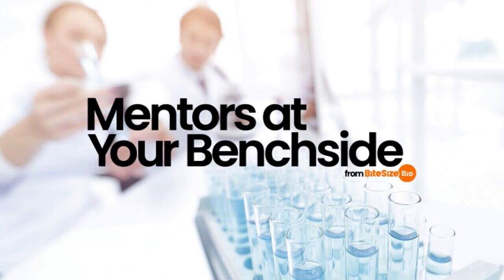1. Photon production. Confocal laser scanning microscopes are based on conventional optical microscopes, but instead of a lamp, a laser beam is focused on the sample. The intensity of the laser light is adjusted by neutral density filters and brought to a set of scanning mirrors that can move very precisely and quickly. One mirror tilts the beam in the X direction, the other in the Y direction. Together they tilt the beam in a raster fashion. The beam is then brought back to the focal plane of the objective lens, which focuses it onto your sample.